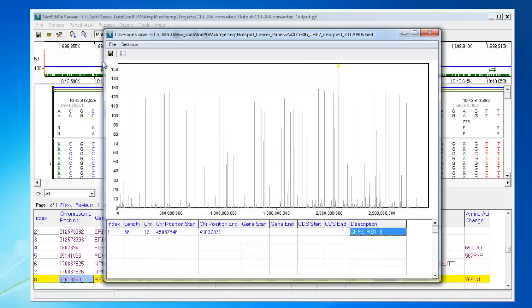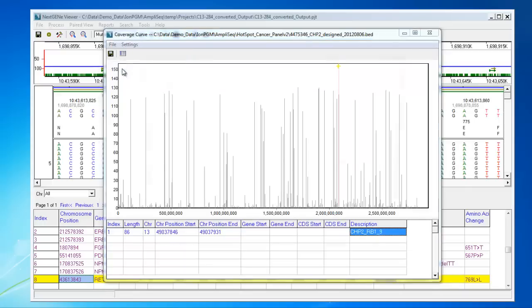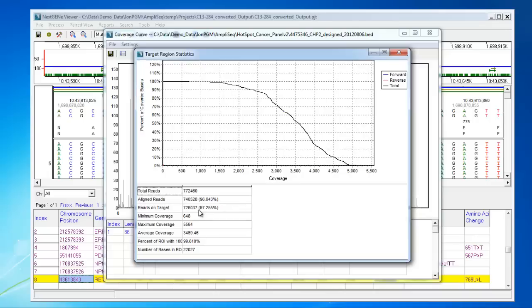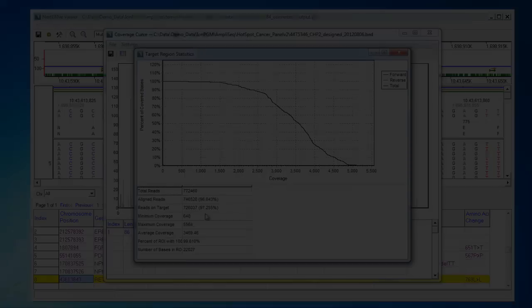This report can be saved by going to File, Save. Additionally, from the File menu, you can access the target region statistics. This gives you a general summary of the coverage of your target regions. You can see the number of aligned reads compared to the number of aligned reads on target. Also, the minimum, maximum, and average coverage for target regions are reported.